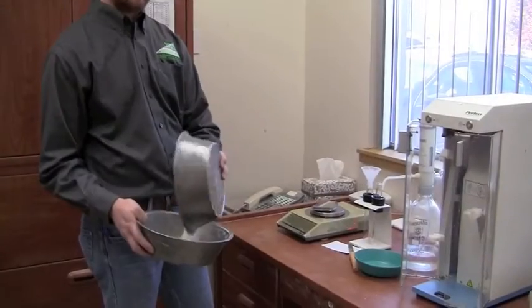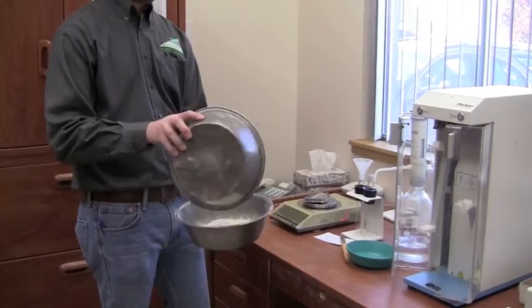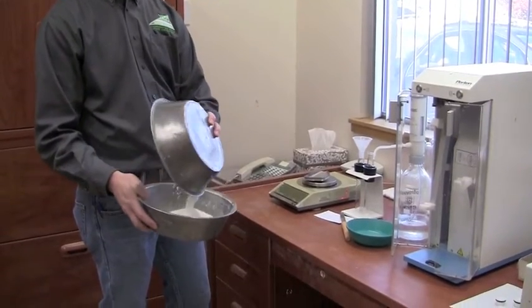Scott is now mixing the flour to get a representative portion. We're only going to be using 7 grams in each test tube.